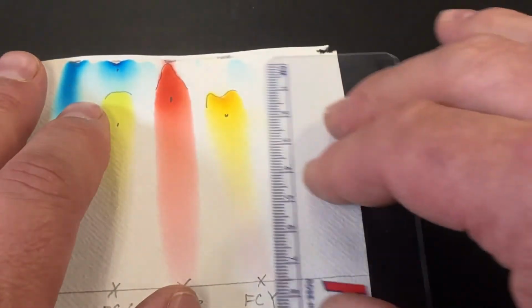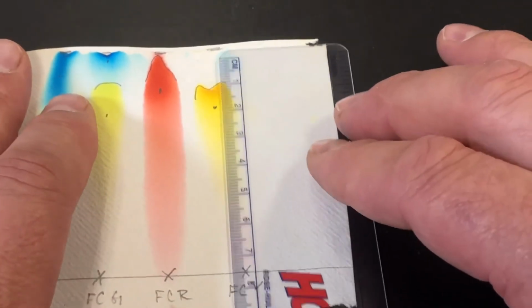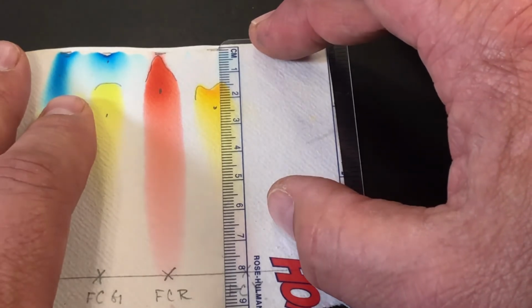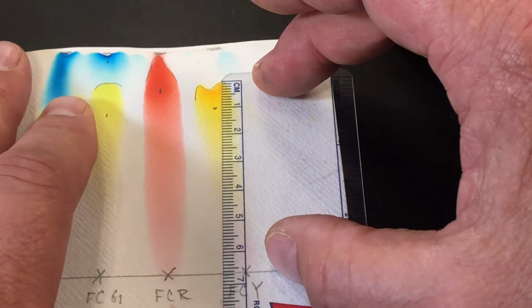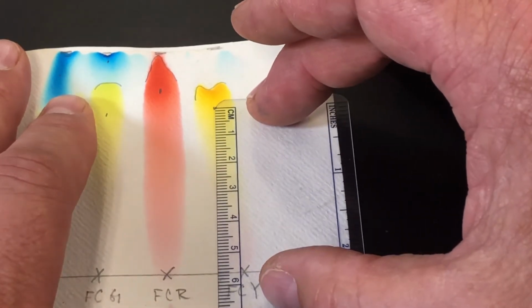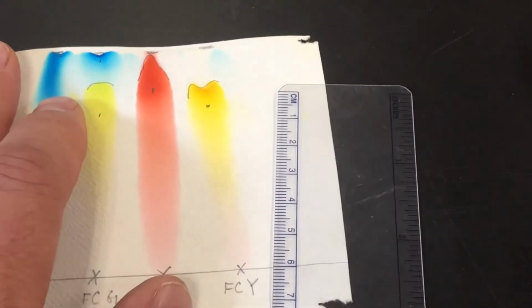Over here in our food coloring yellow, again, I think these little dots here were not part of the yellow. These came from some of the contamination. And so here we go. Again, the travel is 8.00. The very tip of the yellow is 6.65. And the center mass, if you wanted to do it instead, is 5.60.